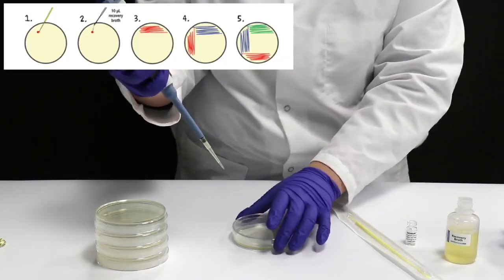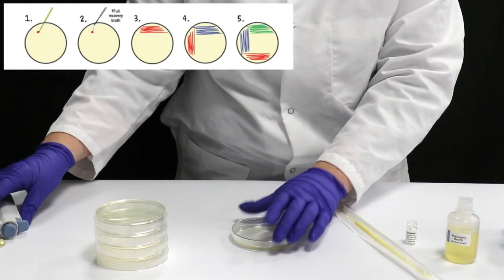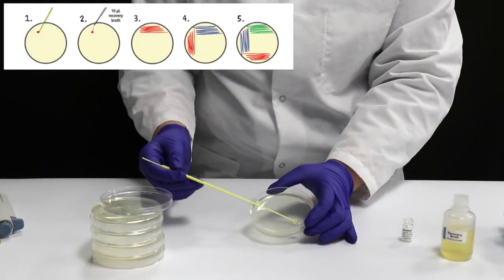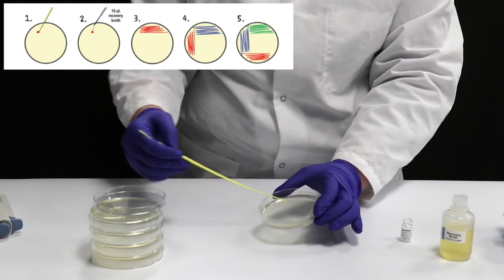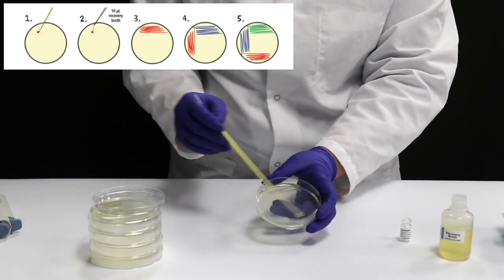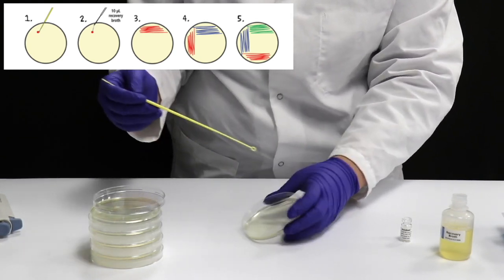Dissolve the bead by adding 10 µL of recovery broth. Streak the loop back and forth through the dissolved Bacto bead to make a primary streak. Rotate the plate 90 degrees and streak through the primary streak once, creating zigzags across a clean section of the plate. Continue this pattern of streaking across the plate.